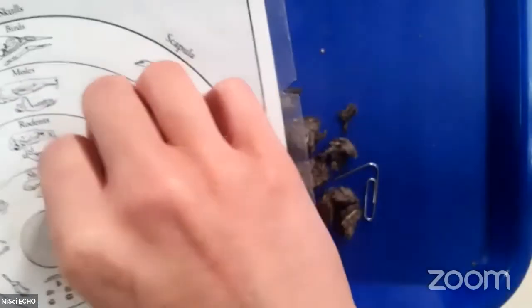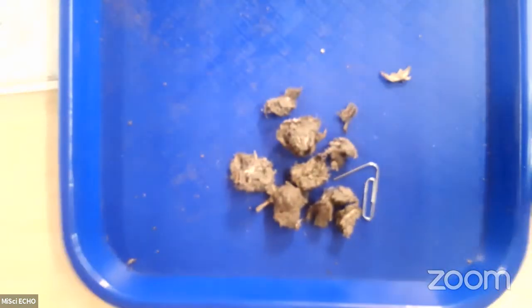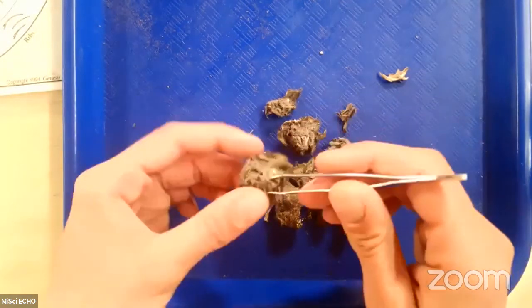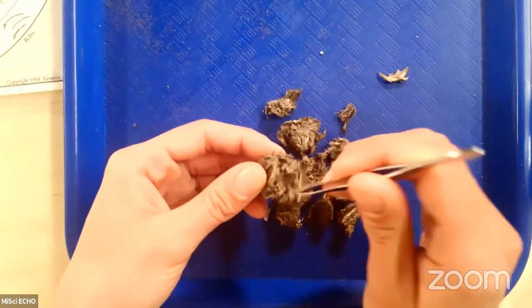So good job, everybody. That's the first step. And honestly, the most important is being able to compare it to our dissection guide in order to identify what we're looking at. Now, we said we're going to find all sorts of bones in here, and I can tell that there's something pretty large over on this side of the owl pellet.